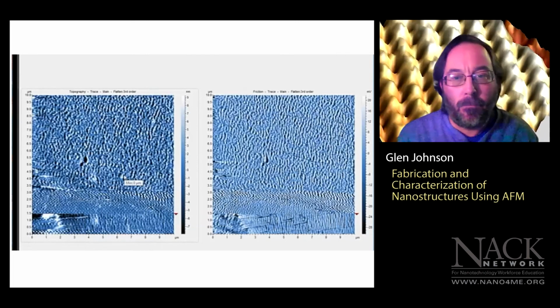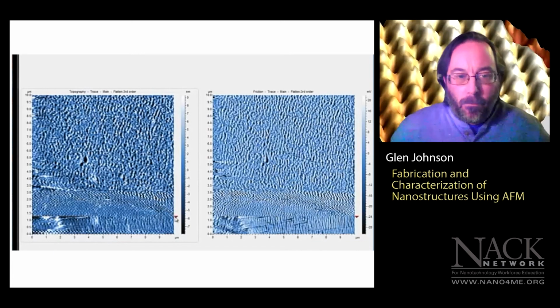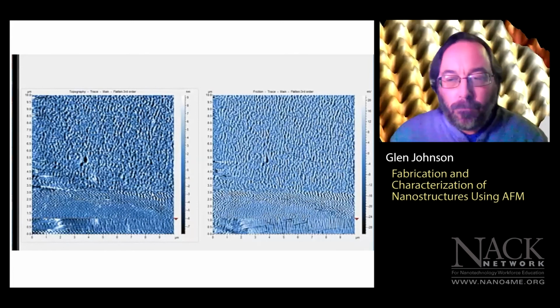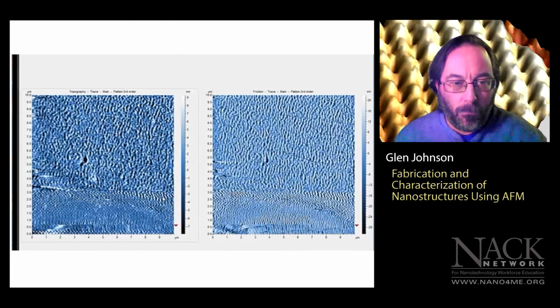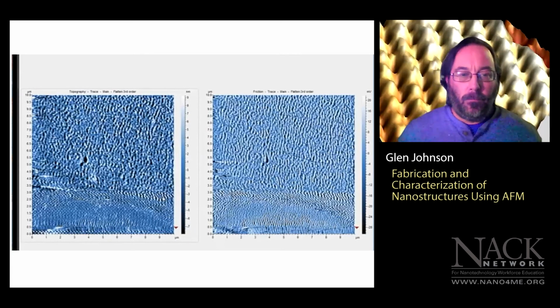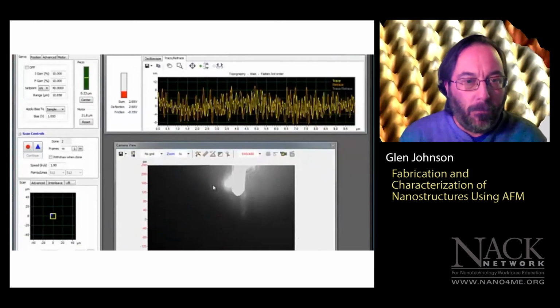Okay, so as this finishes its second scan, if you notice now, the arrow's pointing down. To go all the way up and back down, even on the fastest lines per second, it's been about 15 minutes. When this finishes, we're simply going to stop the scan and we're going to zoom out, and we do so by changing the field of view. Instead of 10 microns, we change it to something larger. At this point, we can go ahead and stop our scan.